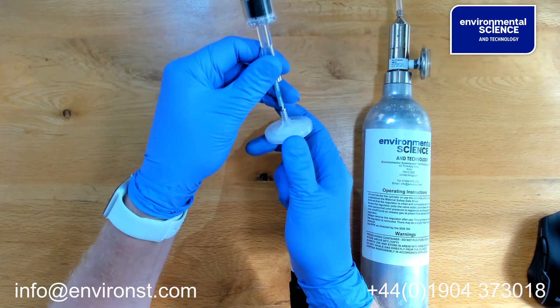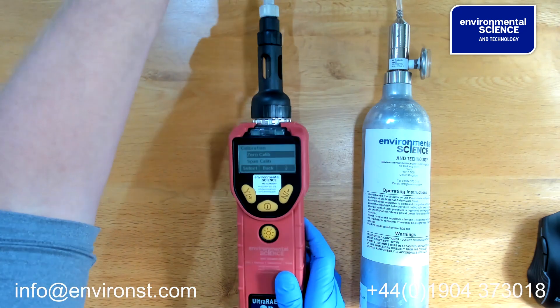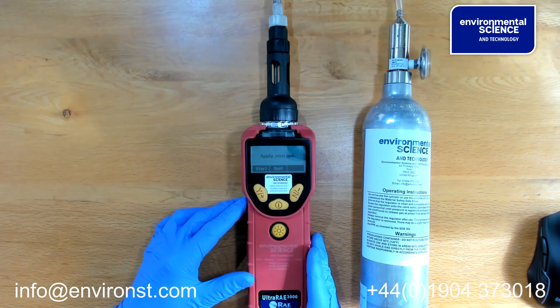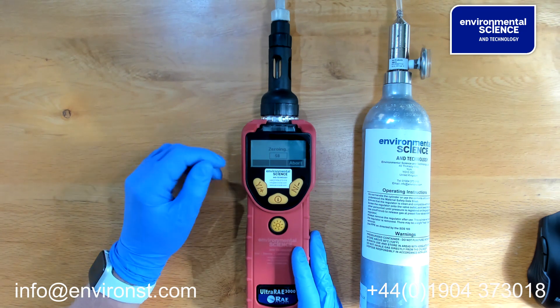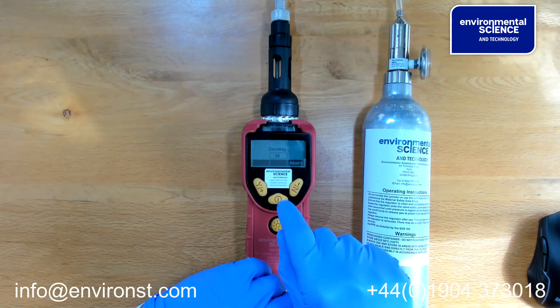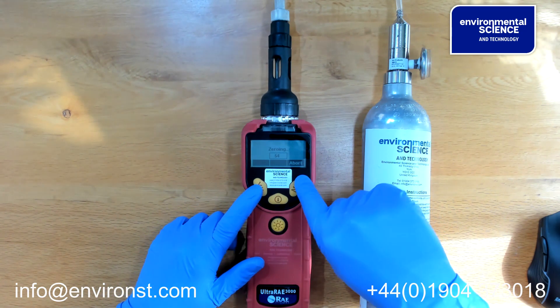You then select zero calibration and press start. This will run for 60 seconds and the unit will be zeroed. We're not going to do this because it's quite a long process for you to watch, but the principle is there.